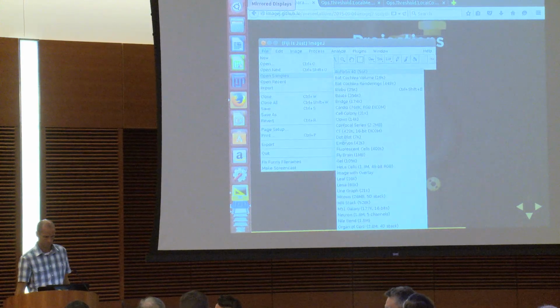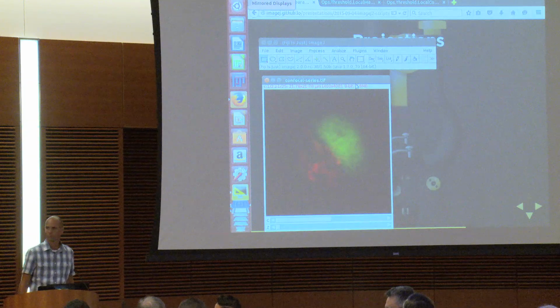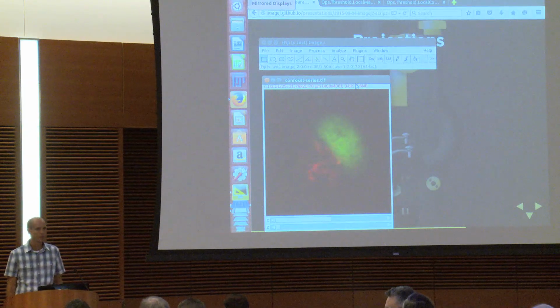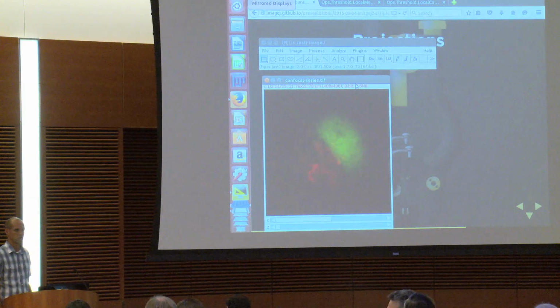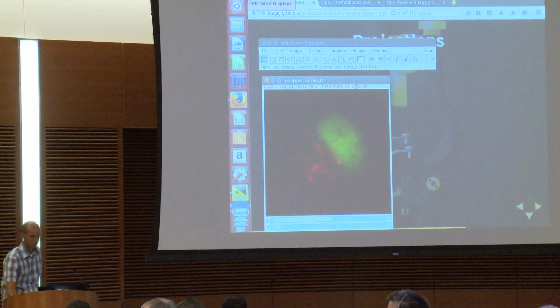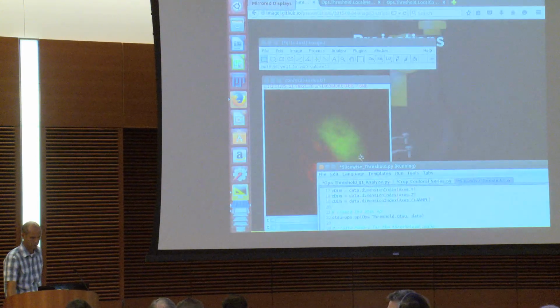Actually, you can also embed scripts in your macro, script snippets, but basically it boils down to writing a script anyway. So I would advise using anything besides the macro language when you're trying to do things that are this complicated. Macros are nice for very fast prototyping with the recorder for simpler things. But if you find yourself with a 1,000-line macro, you should probably stop and ask, is this really the best way?